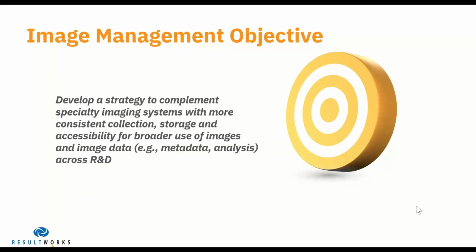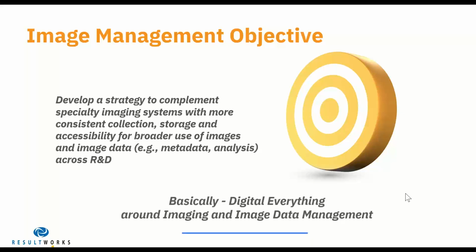So the objective that this client had, that we worked through with them, was really to develop a strategy to complement some of the specialty imaging systems that were being used, and instill a more consistent way to collect images, to store images, to access images for broader use, both of the images and the image data. Image data, think metadata, analysis type data, and that's across the R&D spectrum. At the end of the day, the ask was basically digital everything around imaging and image data management. So that was how we started.